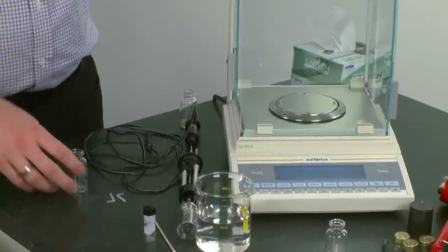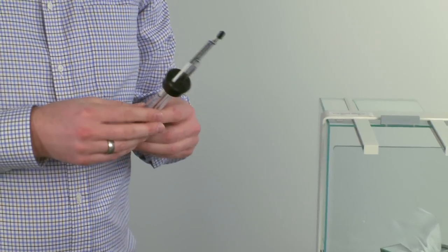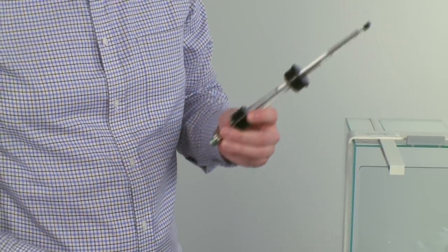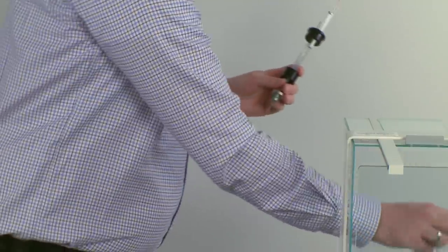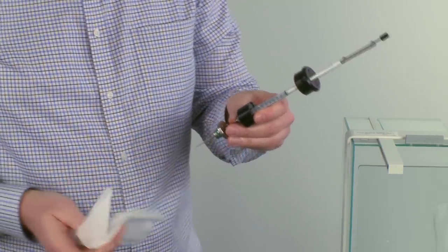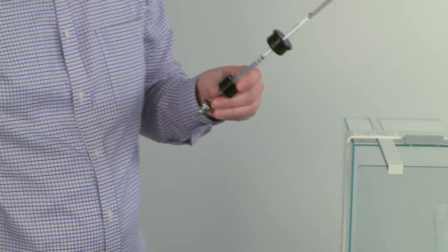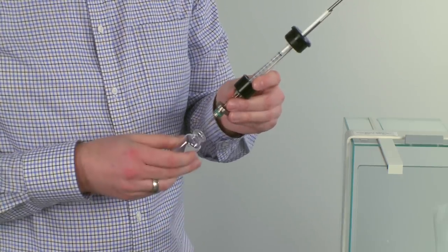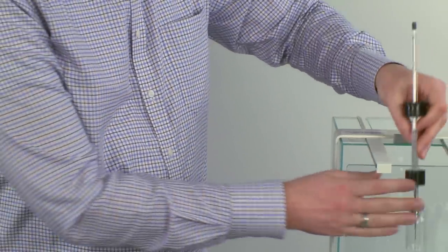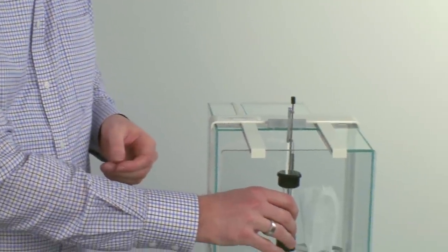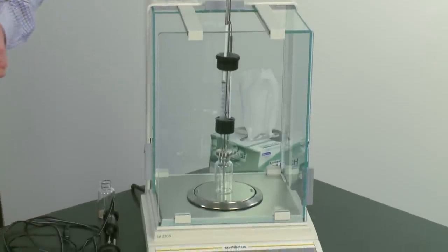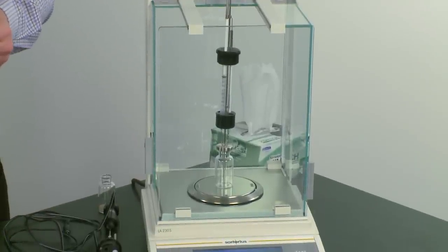To determine the precise amount of water, we'll weigh the filled AdMix again. First, wipe off the remaining water from the outside of the cannula. Then remount the ampoule and weigh the whole AdMix on the balance to know the precise mass of water you're using.